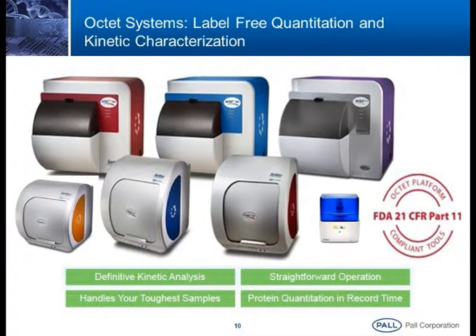And this is the blue model. It has a similar 8 channel function, but this instrument is not useful for small molecule interactions or small molecule protein interactions. We can only go from proteins to megadaltons; small peptides or small molecules are not possible with this. This is the one recently launched. This is a 2 channel instrument, especially for academia. It only takes 2 samples at a time.